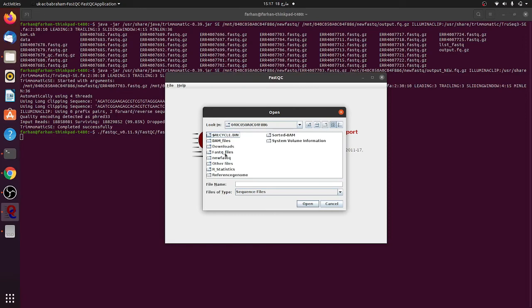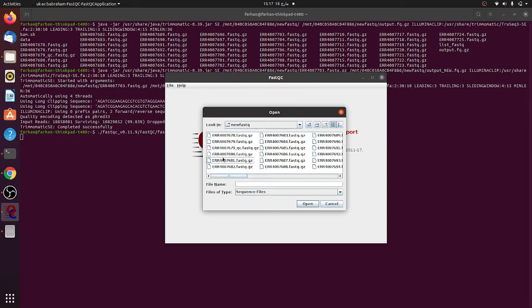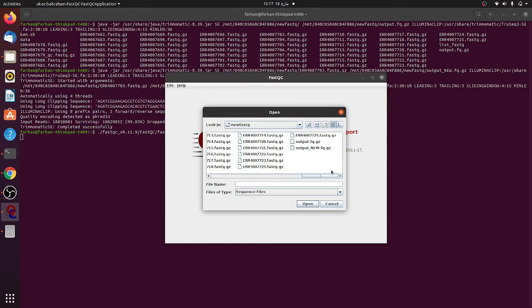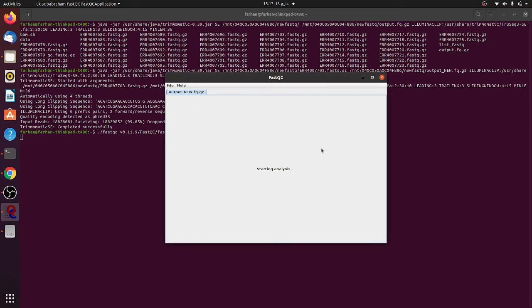Here in mnt and new FASTQ files, you can see these are new FASTQ files. In the end is a new output like this one. We can just select the file and it will load and then it will share the result with us.